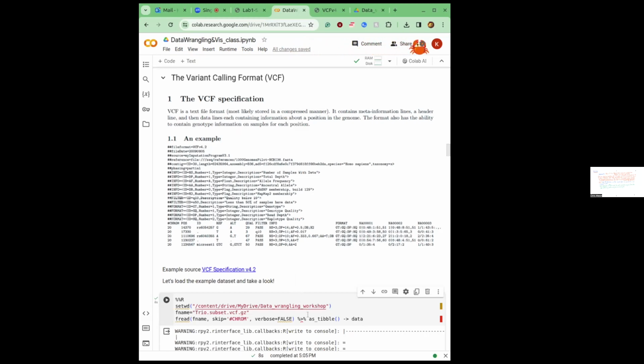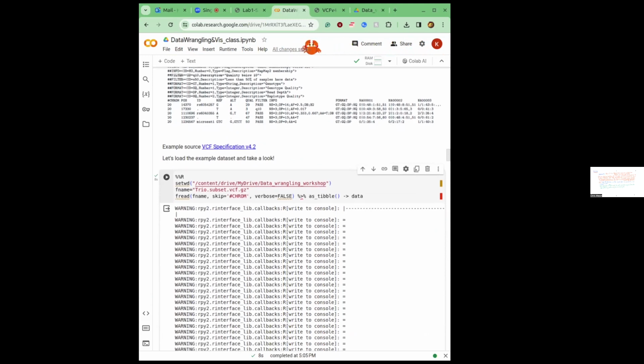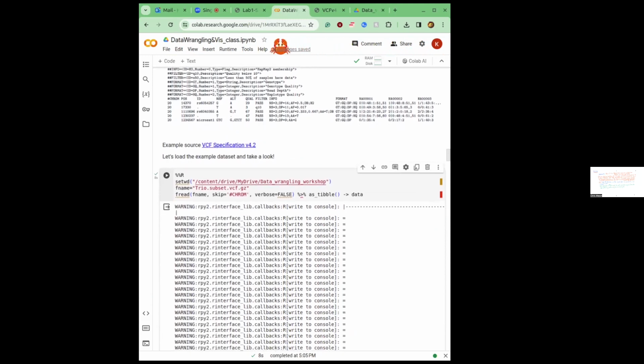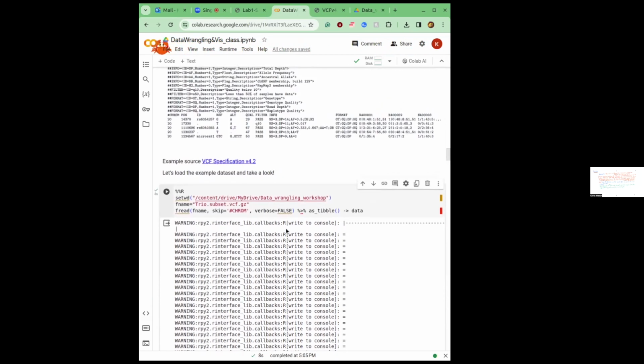In my opinion, there are kind of two camps. I'm in the tidyverse camp. The data.table readability is, yeah, harsh, so I like to use the tidyverse. But the performance in terms of reading the data specifically is completely not comparable. So here we use fread to read the data.